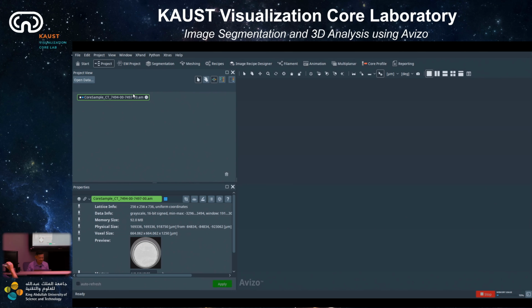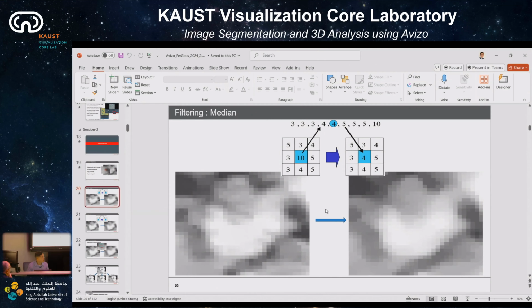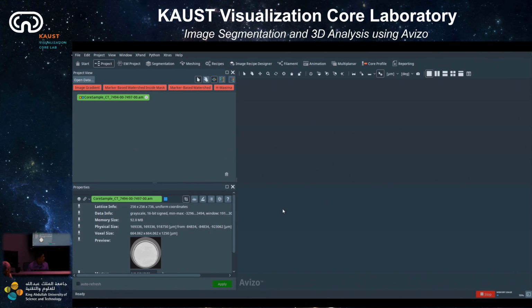And you can also change the voxel size here, if you would like to. So just click on this here, the crop editor. And when you select the crop editor, you should see, no, strange. I don't see the box. Anyway, you should see that there is a voxel size in the resolution, and you can change the voxel size if it's not correct, but I just use it as this.